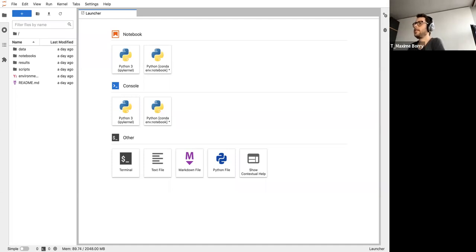Can damage have any effects on the paired alignments? I'm not too sure I understand your question, Anna. Whether you work with single end data or paired end data, you will have damage anyway. It doesn't influence it so much. With paired end data, you will get slightly better sequencing quality because you sequence both ends. The 3' end in the middle is sequenced better because it's overlapping from the two ends, but it doesn't influence the damage so much.